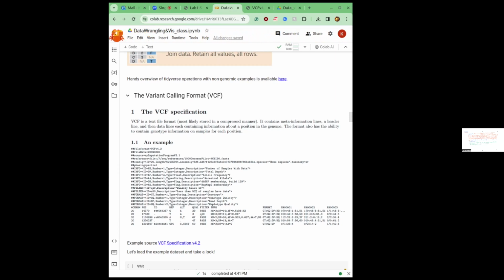Usually you would either get two separate files for indels and for SNVs, or you would specify a mode that you want to use. In single molecule sequencing, the concept of variant calling is very interesting, and I don't think it's that widespread in research, but we can figure out how it would be appropriate for this class.